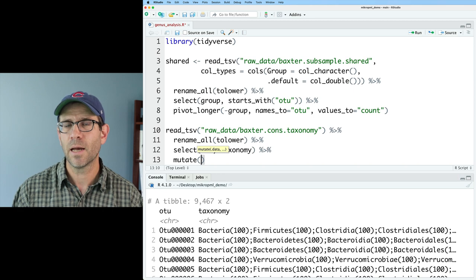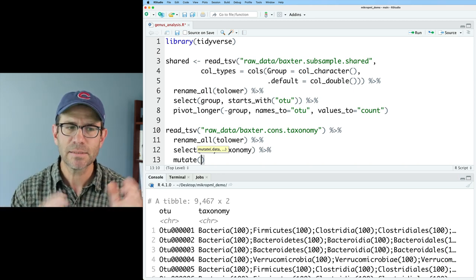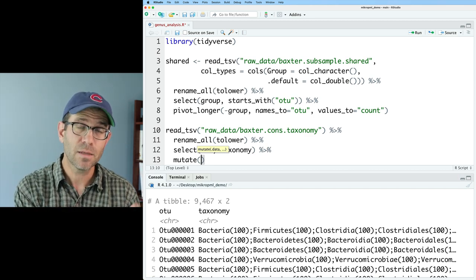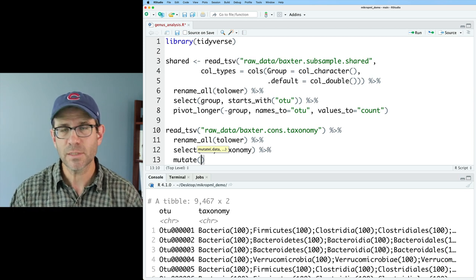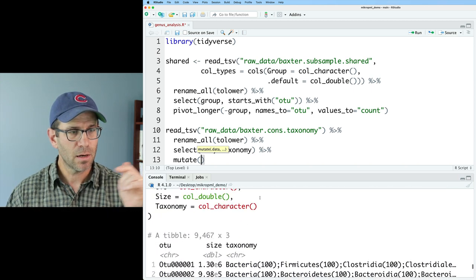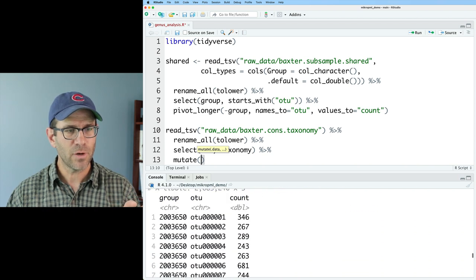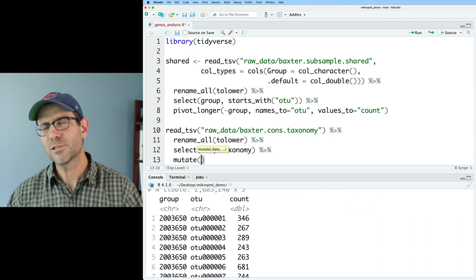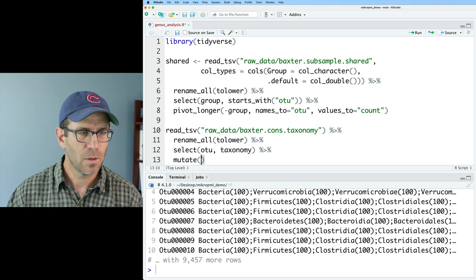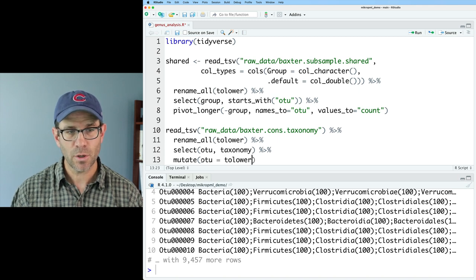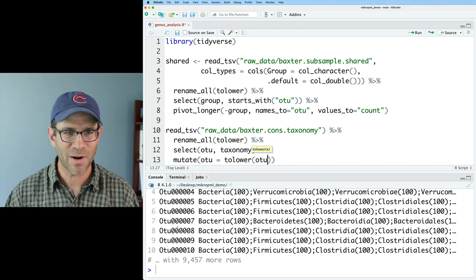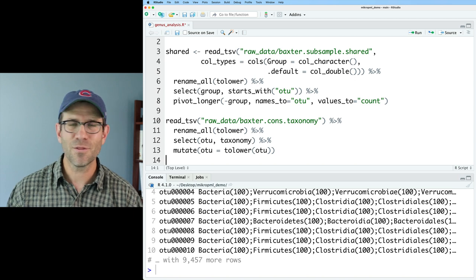I'm going to do a mutate line — mutate allows us to change existing columns or add new columns. First, let's write over the OTU column. I want to make all those OTU names lowercase because way up in the shared data frame all those OTU names are already lowercase. So we'll do OTU equals tolower(OTU). And sure enough, after running this, we see all those O's are lowercase.